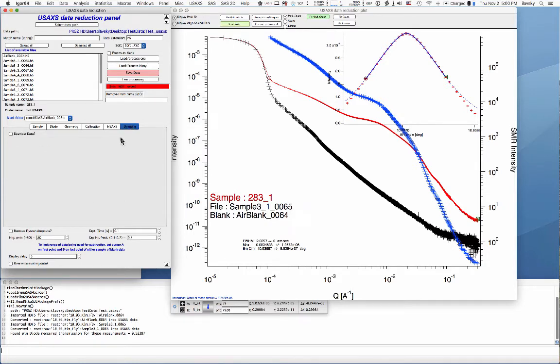One option you may want to use is de-smearing. If you use IRENA for modeling, IRENA understands slit-smear data, so you don't have to de-smear. This instrument uses slit-smeared geometry: it has very high vertical collimation — about 10⁻⁴ inverse angstroms resolution — but is wide open horizontally, which changes how intensity is collected. IRENA can slit-smear the model so you can fit slit-smear data directly, which is preferable because de-smearing increases noise, especially for weakly scattering samples. However, if you want to use any other package — Guinier plots, Python code, or anything else — you must de-smear the data.